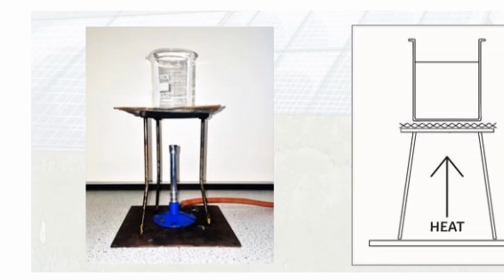How about this? It's a beaker. Okay, you know how to draw a beaker, and there's a liquid here. This is the wire mesh and the tripod, and they also show the tile piece here and the heat. It's a perfect drawing.